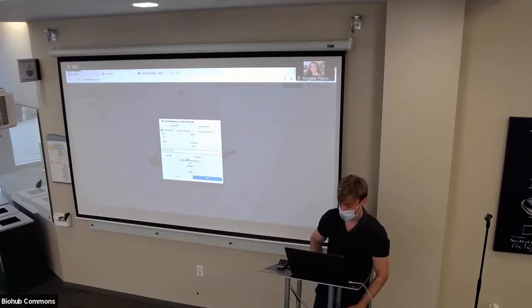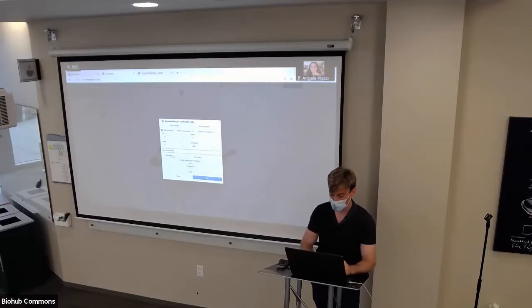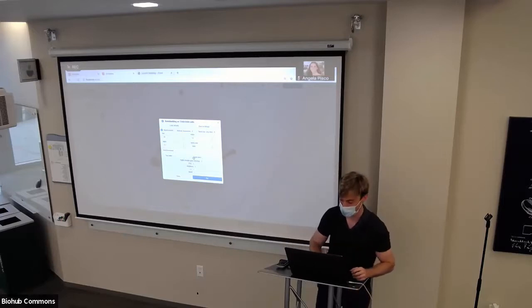And then there are a lot of different knobs here. I'm going to ignore this left checkbox here, because it's my personal single cell analysis algorithm that I developed in my PhD, which I wanted to include, but most people won't really need to use it. But if you wanted to, you'll see that it'll just deselect certain options that aren't relevant for that algorithm. For now, we'll leave it unchecked. Shout out though, it's a really great method. So if you want to use it, go ahead. You'll find that it's clustering much better than your typical Scanpy workflows.